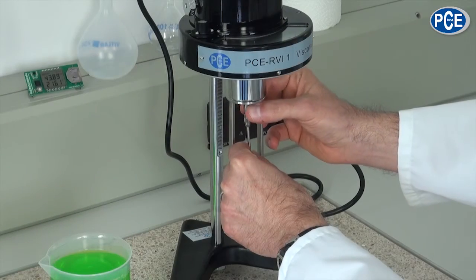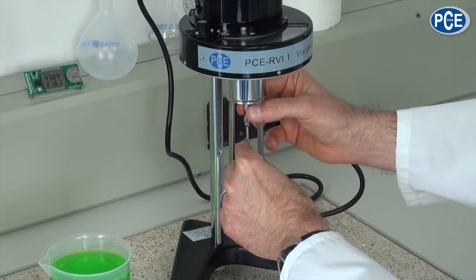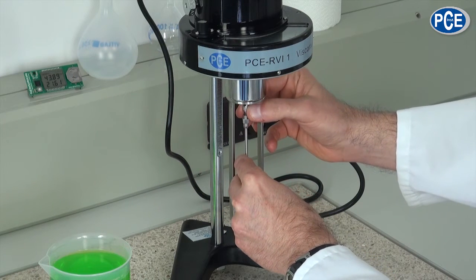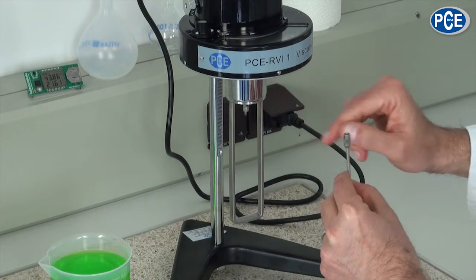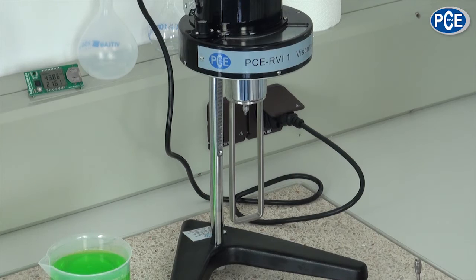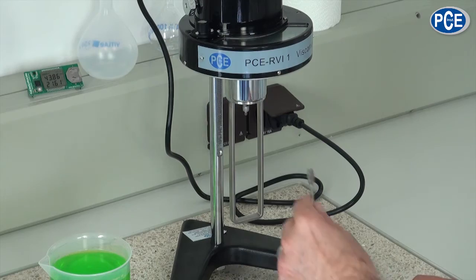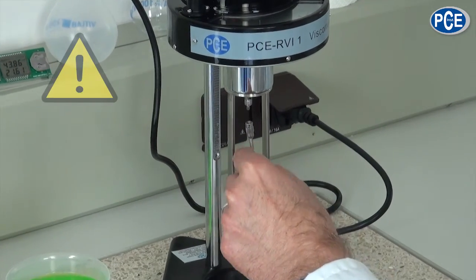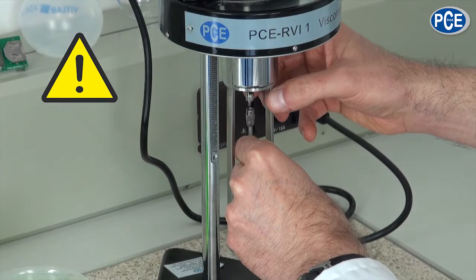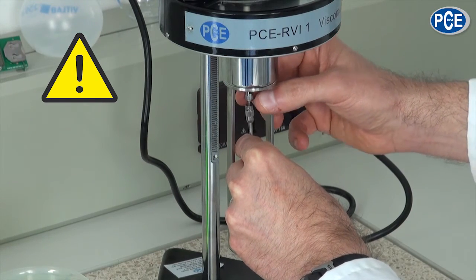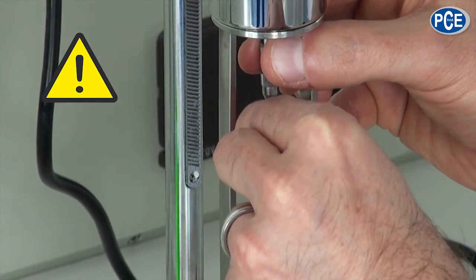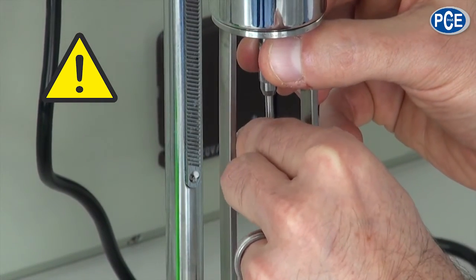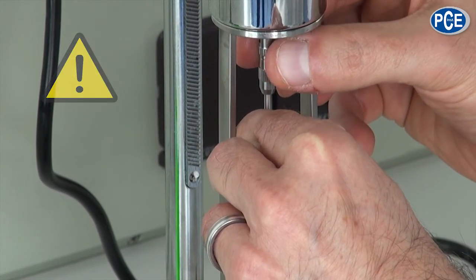The viscometer PCE RVI1 is a precision instrument. The torque is determined from a viscous liquid. The torque is measured by a hairspring inside. Especially when fixing the rotation body, watch that the mechanics are not damaged. That can be prevented when turning the body and lifting it up a bit. The rotation body is carefully screwed on its axis. So it is ensured that the mechanics aren't damaged.